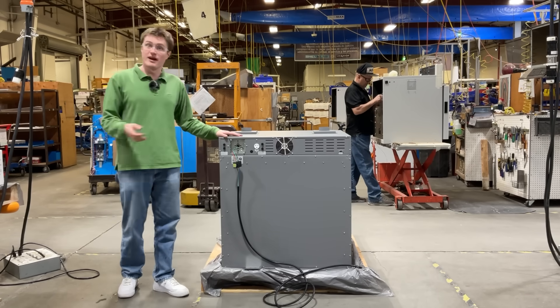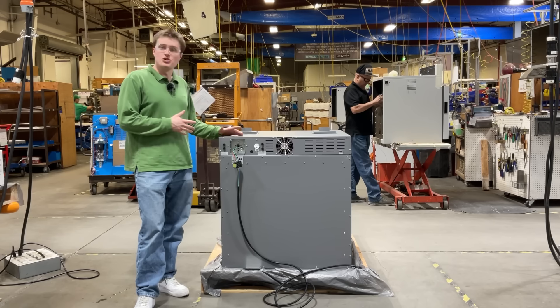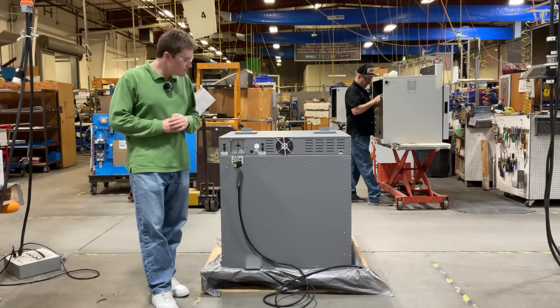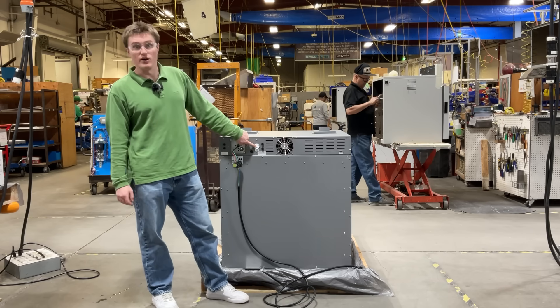Located on the rear of your unit, you will find the main electrical inlet. Each unit must be hardwired to a properly grounded electrical connection. Next to this, you will find a convenience outlet.